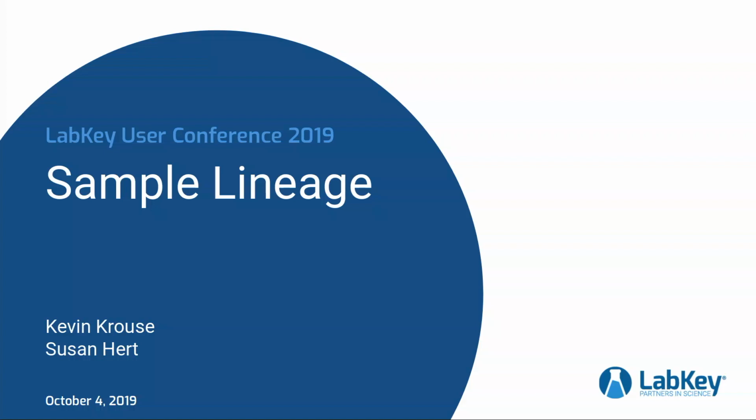All right, so we're going to start here. It's time to talk about sample lineage. You may have heard us talk about lineage here and there in some of the various other talks, and so I'm going to do a little bit of a dive into this topic a little more. This is a little bit developer focused, so if you've got questions about some of the APIs that I'm going to show you, you can come find me later.